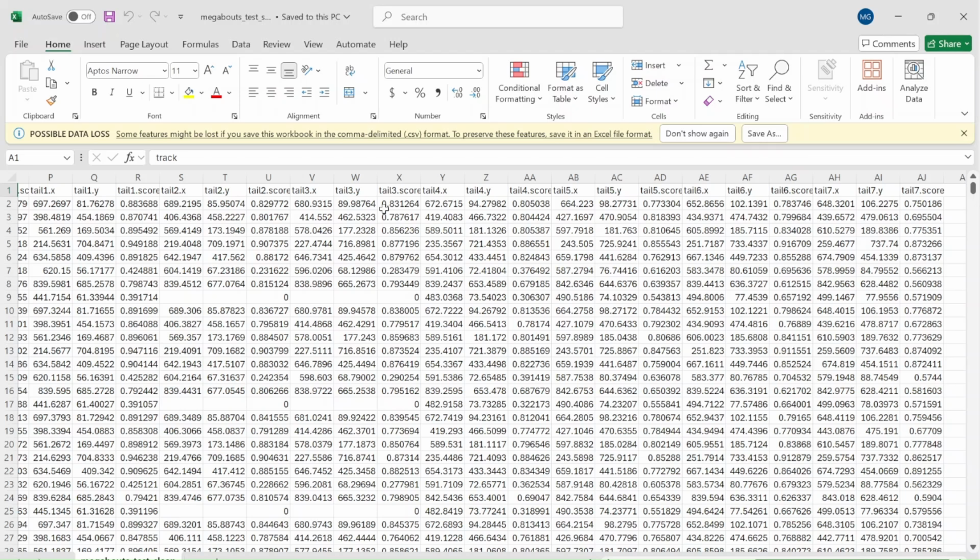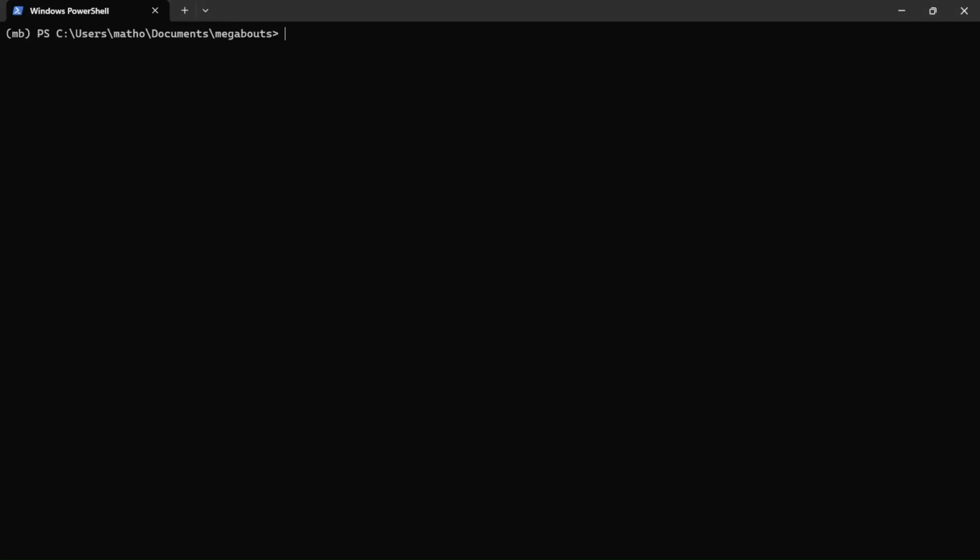As you could probably see from the video earlier, the larval zebrafish have really long tails, and it turns out that tracking the movements of these tails is really useful for helping us determine when bouts occur and what types of bouts occur. So we take 7 points along the zebrafish's tail. We get their coordinates as well as the associated score for each point. Now, that's what SLEAP outputs. Now, my tool takes that CSV file as input, and it processes that data to output useful information for us.